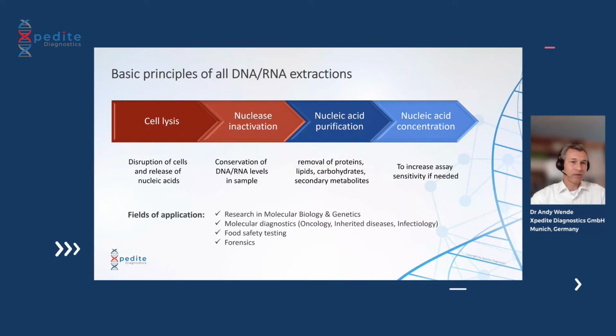These extractions are applied, of course, in research, in molecular biology or genetics, but also a lot, as I said, in molecular diagnostics, which can be infectiology, but also oncology or looking for inherited diseases. And I think also important fields like food safety testing, veterinary testing, but also forensics. All those rely heavily on the extraction of nucleic acids.